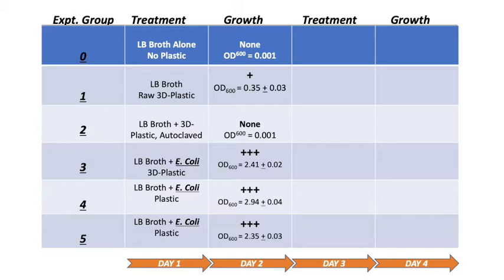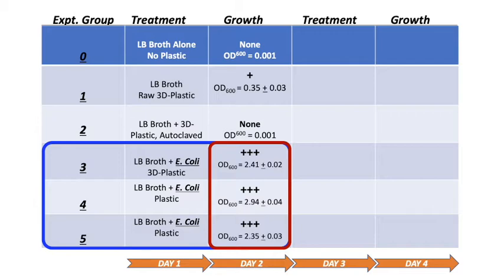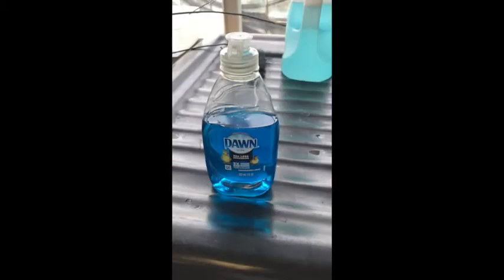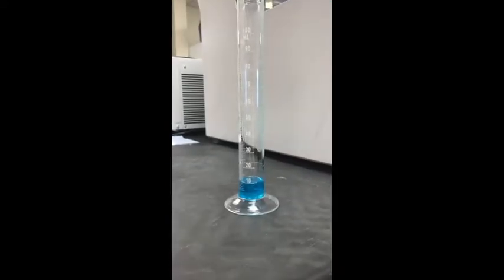So the main goal of this research is to determine a nice treatment for sanitizing or sterilizing. So groups 3, 4, and 5 that were inoculated with E. coli were used in the subsequent experiments. We used soap and bleach plus peroxide, soap, bleach, and the autoclave. And soap plus bleach plus peroxide plus the autoclave to see if there's any growth after growing overnight. So basically plastic that was bathed in a vat of E. coli.